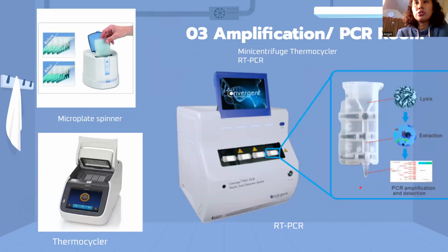Okay, in the amplification room, we have a microplate spinner to mix the microplates that you place in your thermocycler. The thermocycler is our PCR machine, with varying temperatures. What are the temperatures of the thermocycler?